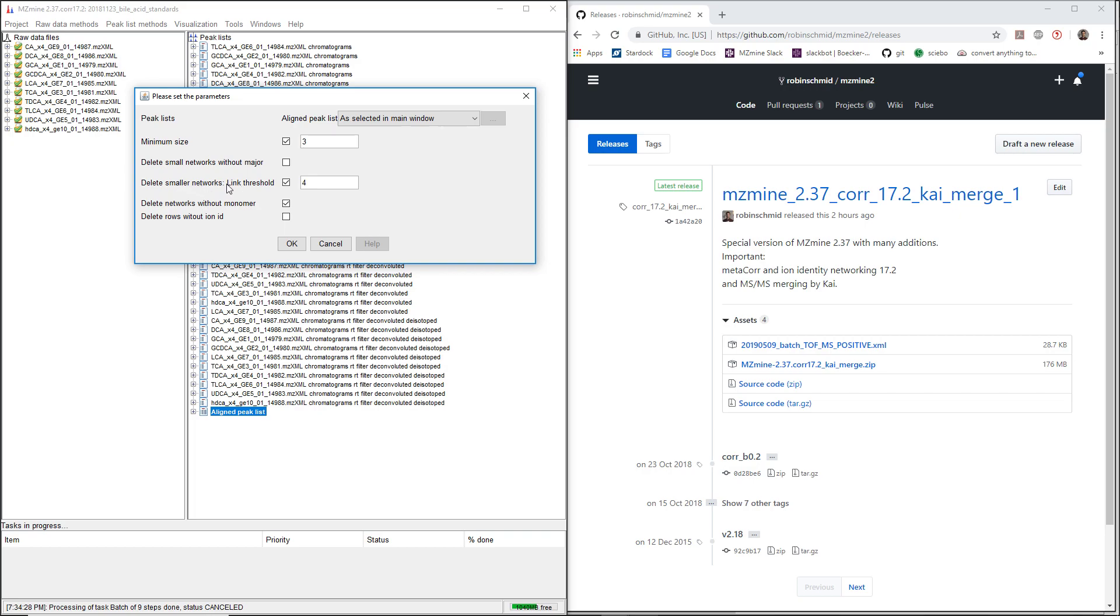We're going to create different networks that are very similar, but in one network we just have a bit more adducts in there, and then we just delete the smaller subnetworks there.